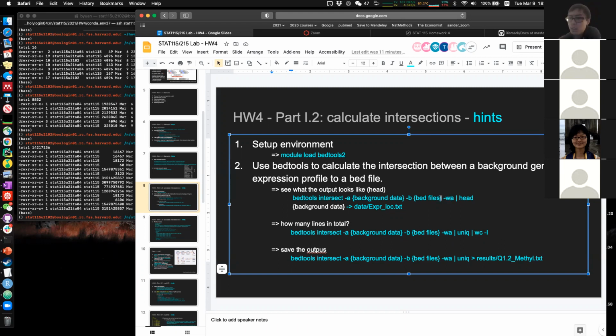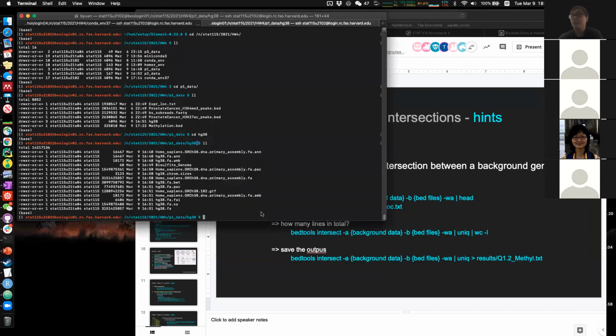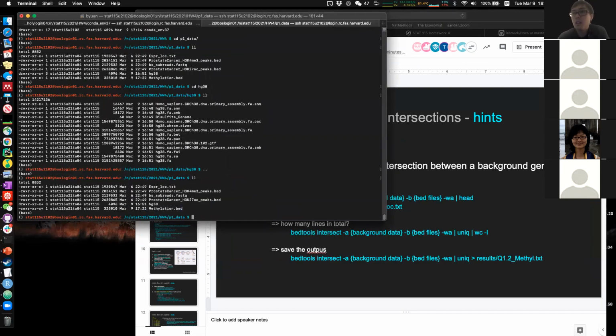So here, just a very brief recap of the bash scripts. Using this vertical line symbol is the bash language's way of appending additional commands after you finish the first one. For example, now imagine, say, I want to take a head of this file.